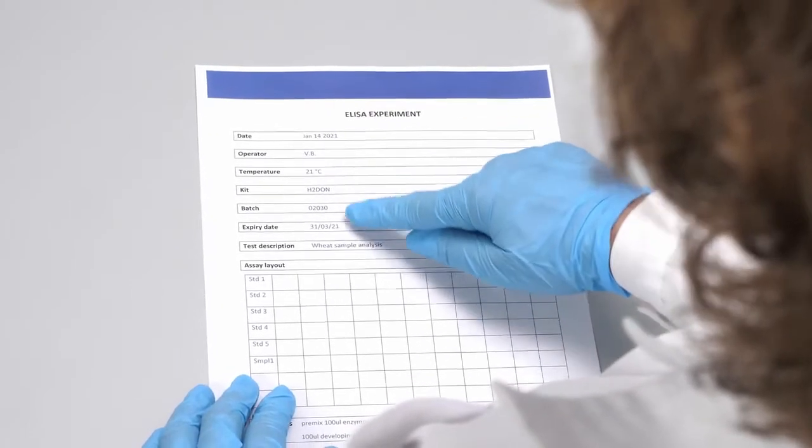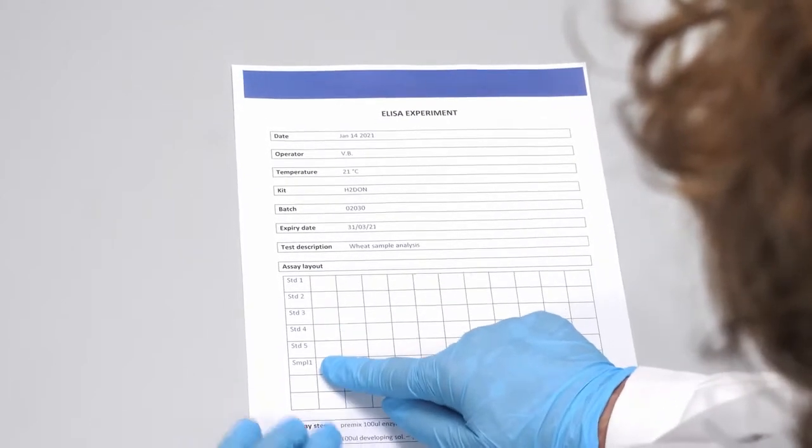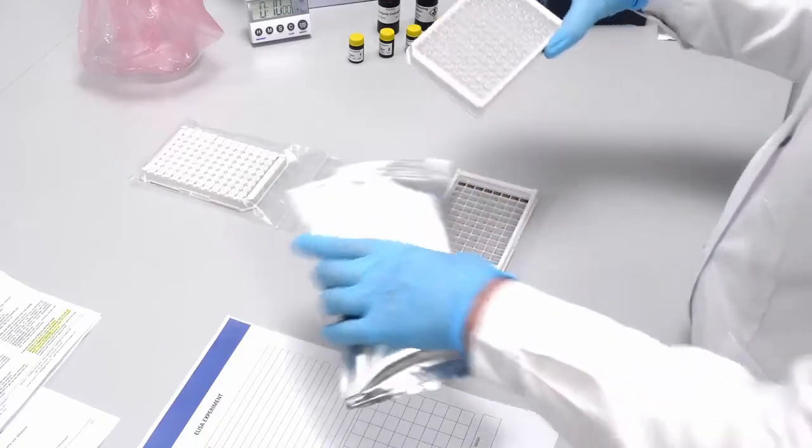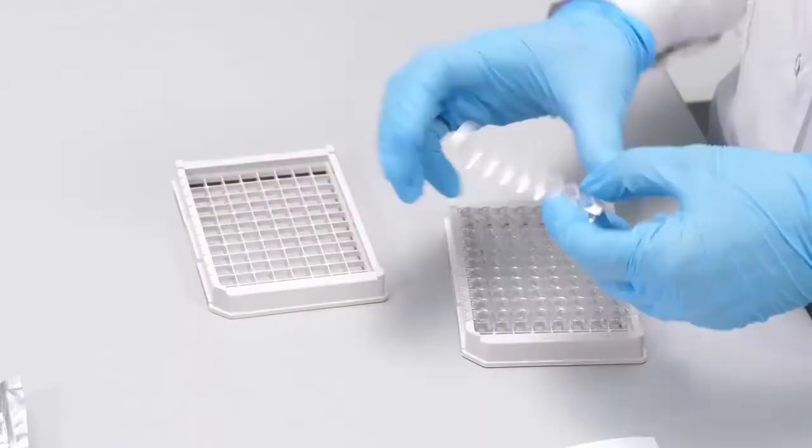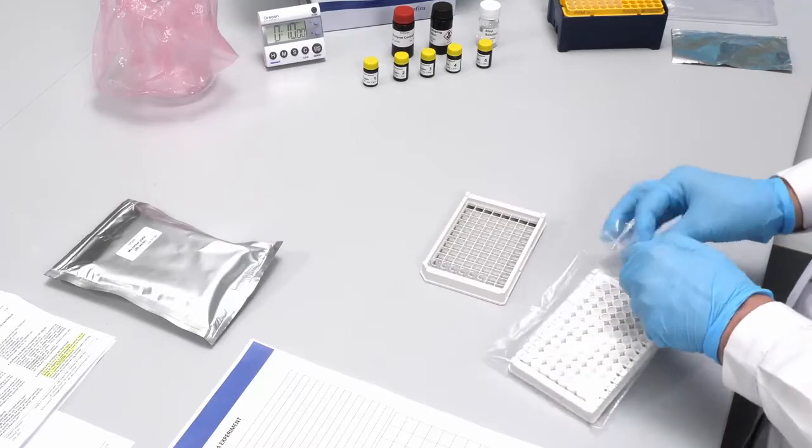Draw your experiment sheet and assay layout. Record the position of each standard and sample. Prepare the necessary wells for the session. You need one reaction well and one premixing well for each standard and sample.